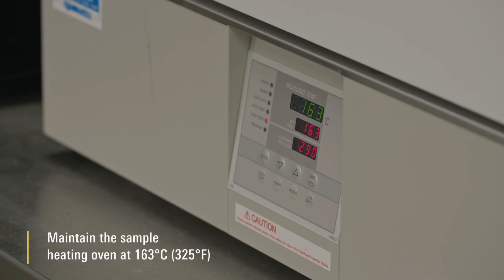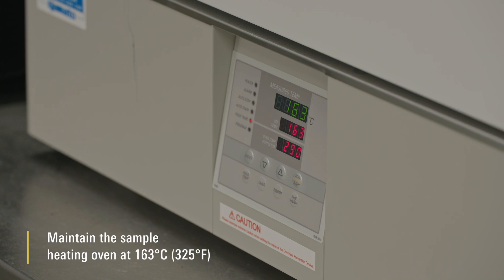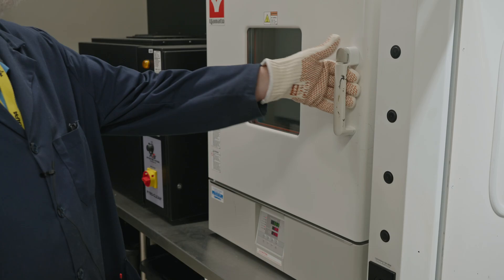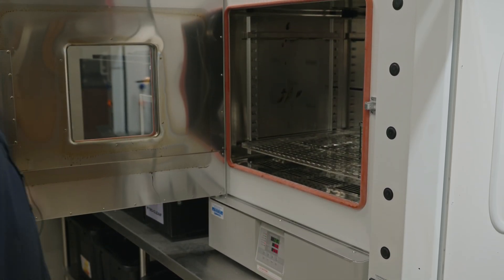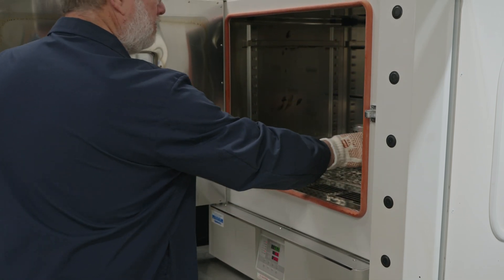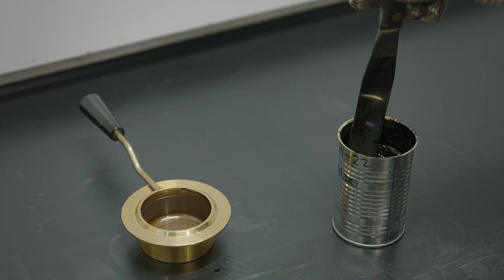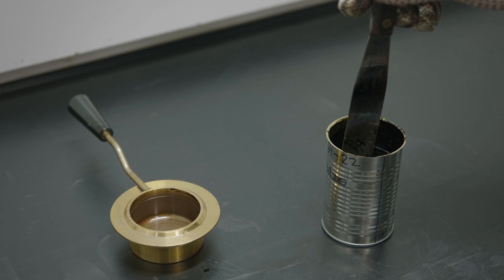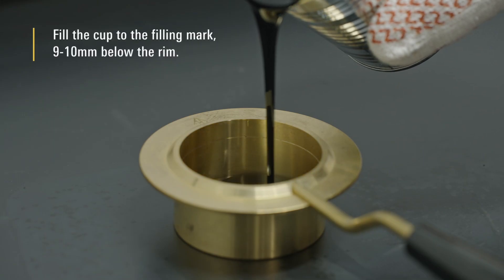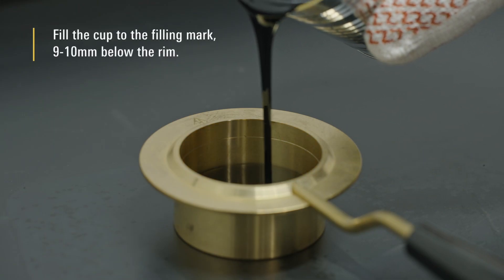Maintain the sample heating oven at 163 ºC. Heat the sample in a container with a loosely fitted lid for the minimum time necessary to completely liquefy the sample. Manually stir the sample without incorporating air bubbles. Fill the cup to the filling mark 9-10 mm below the rim.